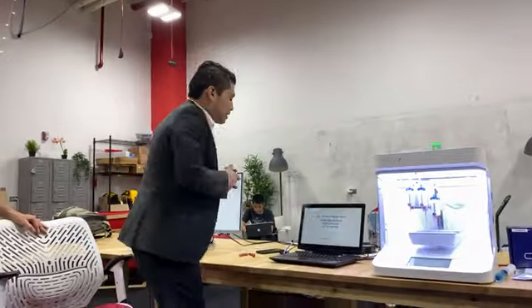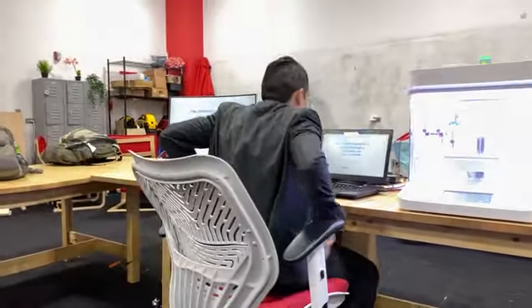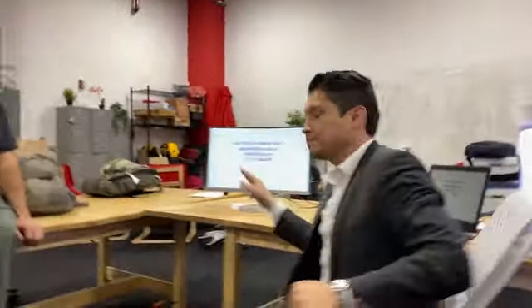So, I'm gonna show, maybe you can see here, sorry. That's okay for you? Yeah.